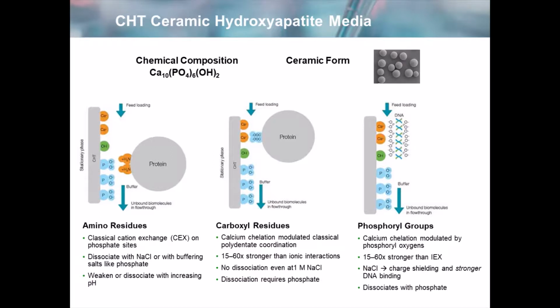So the crystal structure of hydroxyapatite contains phosphoryl groups which would carry negative charges. They interact with the amine groups on the protein surface via charge interaction, just like the classical cation exchanger.